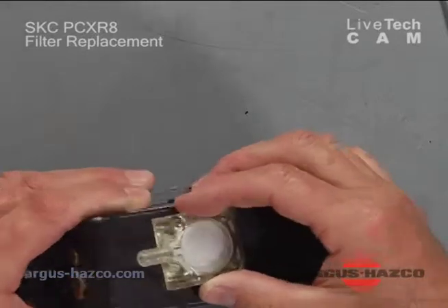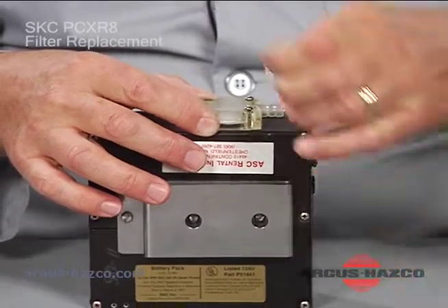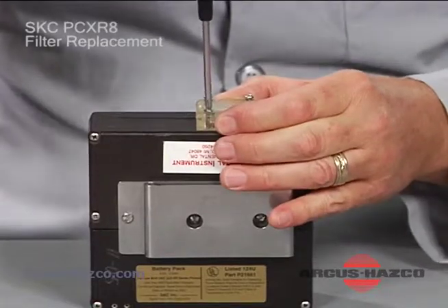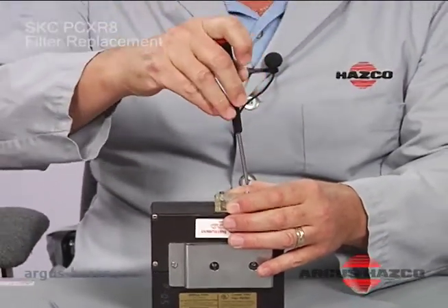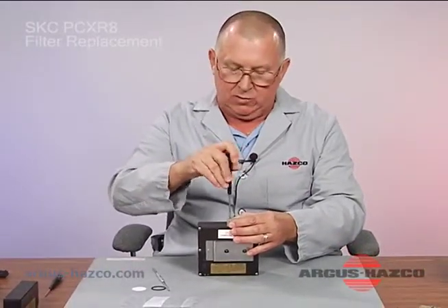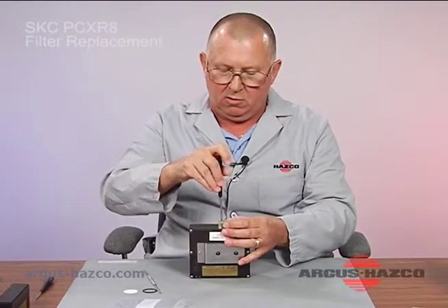You then put the top half of the housing back onto the unit, align the four holes, and reinsert your four screws. Gently but firmly secure the housing without over-tightening or over-torquing — you don't want to crack the housing, as that could cause leaks which will throw off your flow calibration. Go around with each screw and gently snug all four down evenly.